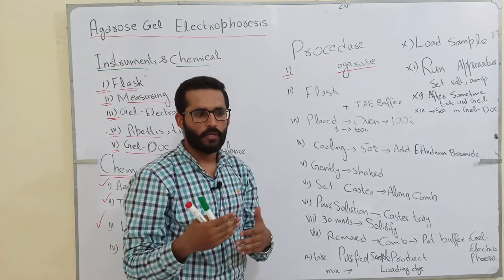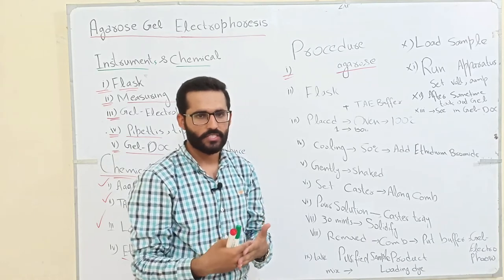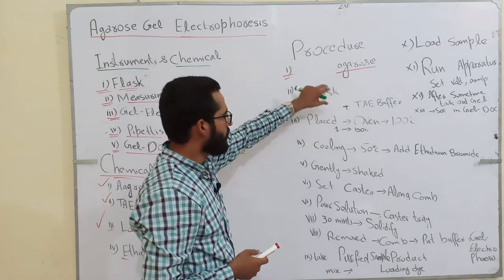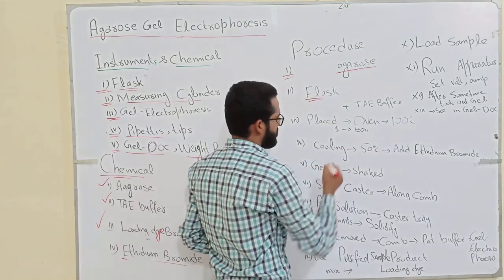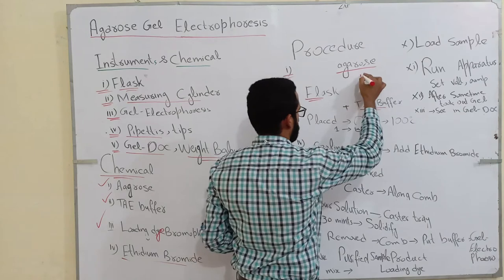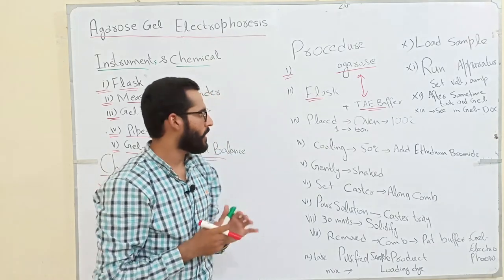If you want to separate 10 to 200 base pair fragments, then you change the agarose concentration accordingly. It depends on your sample and your experiment — whether you use 2%, 5%, or 6% concentration of agarose. First of all, we weigh the agarose on a weight balance, then we put this agarose into the flask and add TAE buffer. When we put these two together into the flask, we shake gently so that they properly mix with each other to prepare the mixture.